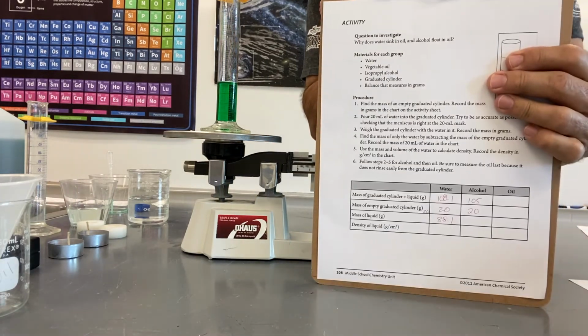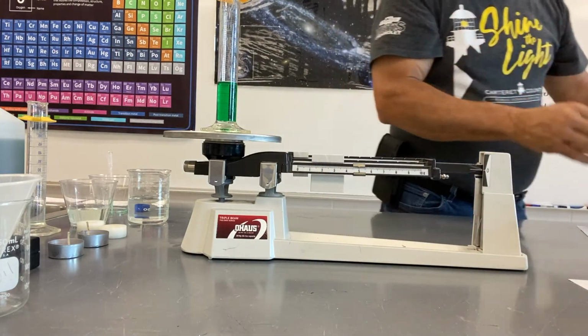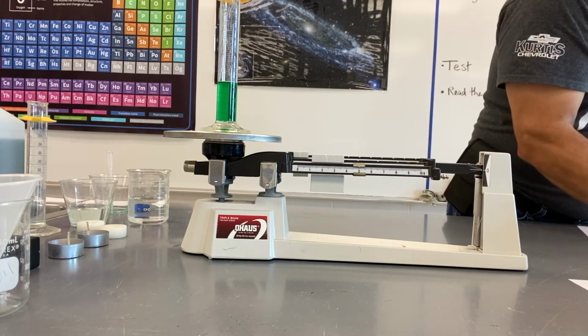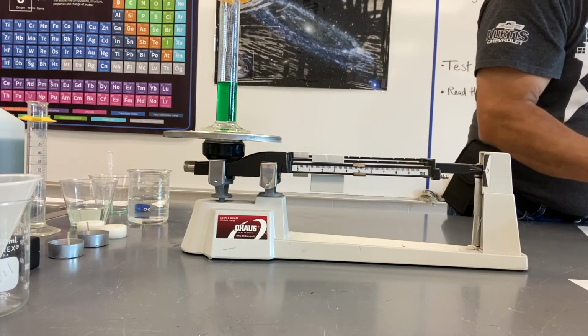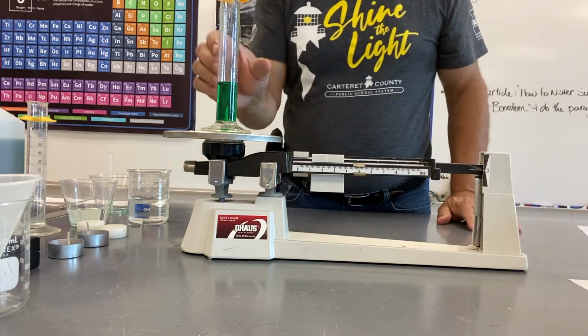Written down my graduated cylinder amount right underneath it in this column here. And then we do the math the rest of the way down. I'm not going to do it out loud now. It's your turn. I'm not finding the density of the liquids yet, the bottom row there. We'll do that in just a minute. Let's do this part of the lab first.